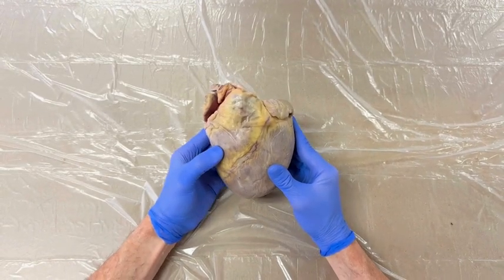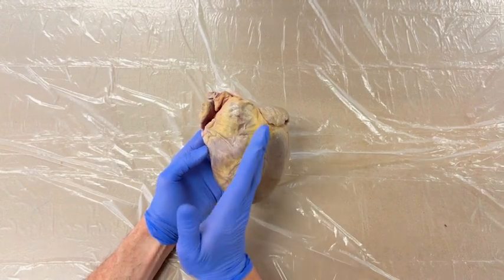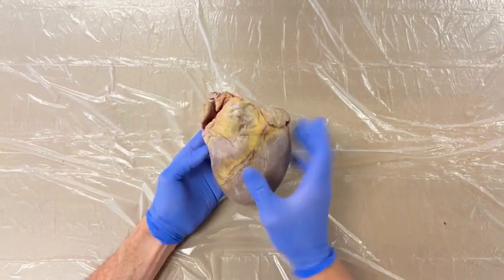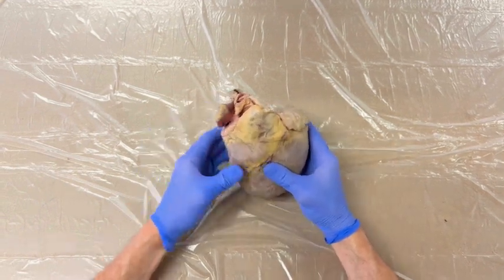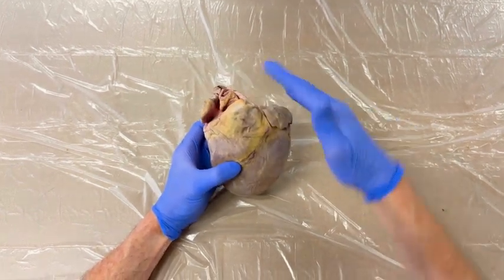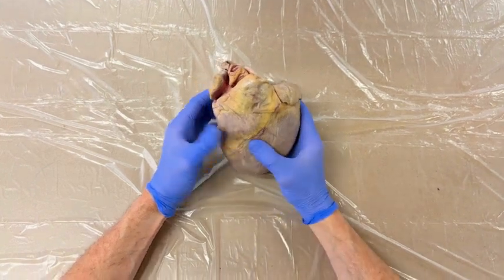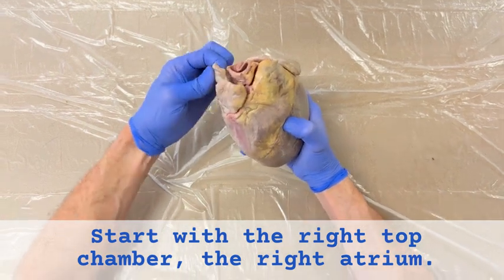So we have this heart facing front. This is the interventricular sulcus. So we know that the right-sided chambers are over here. This is the base of the heart with the auricles or ears pointing toward us. So we know that this is the top part of the heart or base of the heart, and this is the apex. So I'm going to start with the right top chamber or the right atrium.